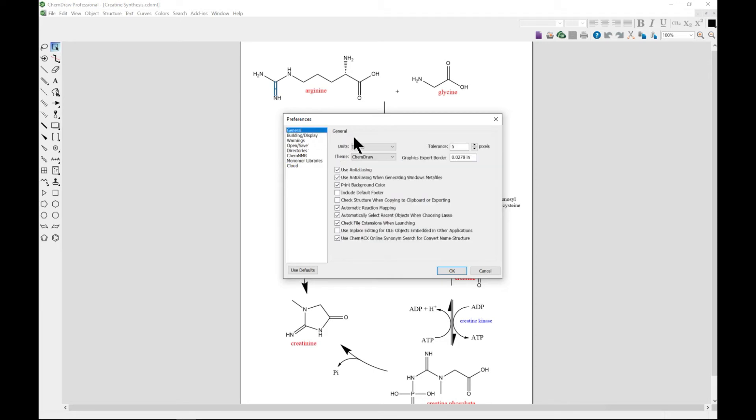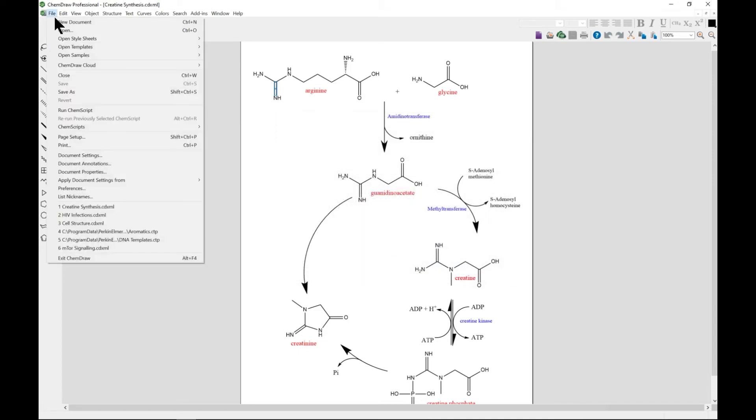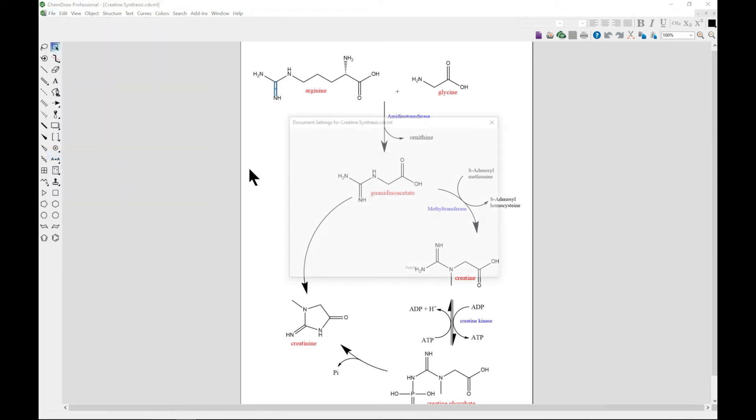You have your general preferences. You can change the unit to point, so let's say we change it to point. This is New Document. Now in a new document we're going to Document Settings.